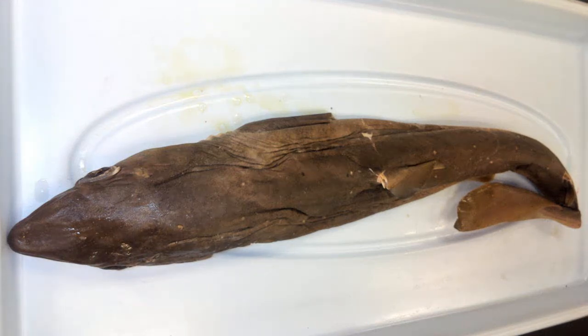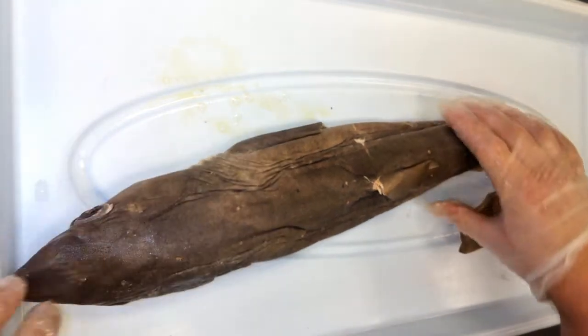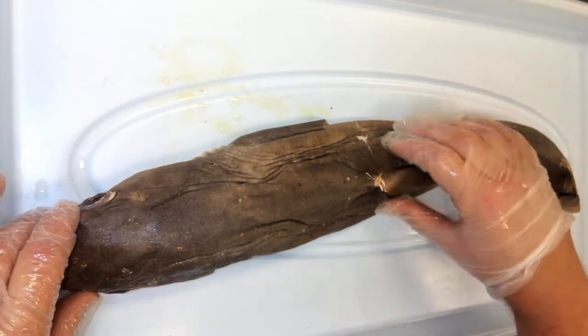Hello everyone. Today I have a shark, which is a type of cartilaginous fish, meaning its skeleton is mostly made up of cartilage and not bone. This particular shark is of the smaller species known as a dogfish shark. The scientific name is Squalus acanthias.